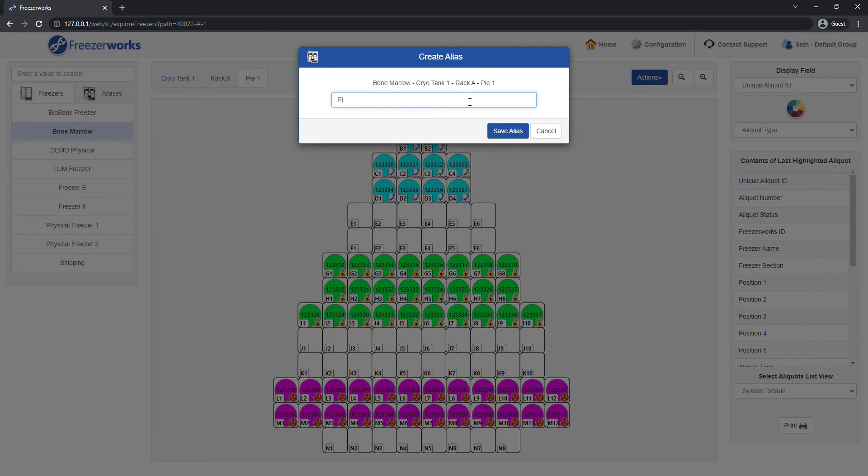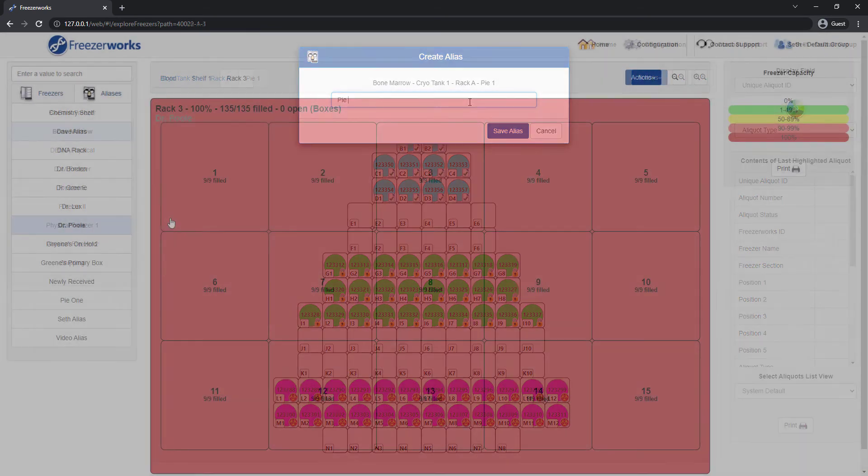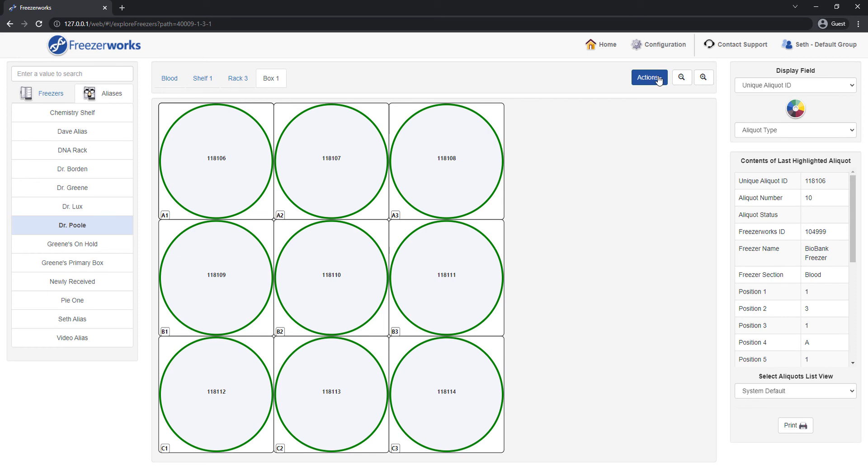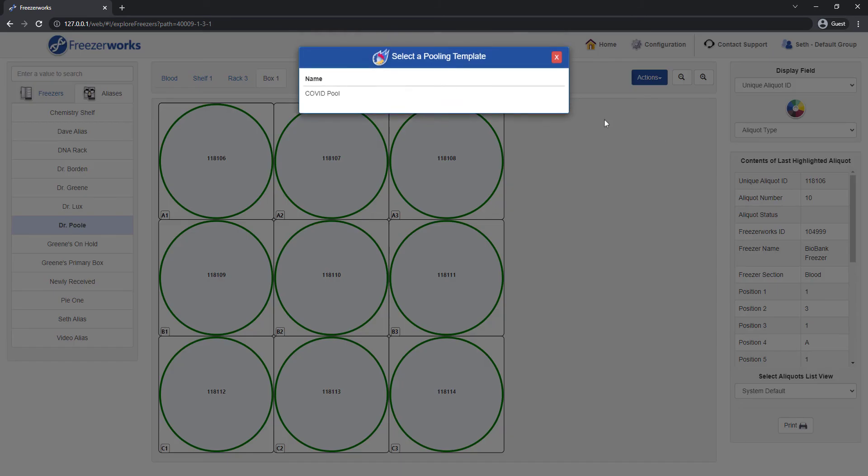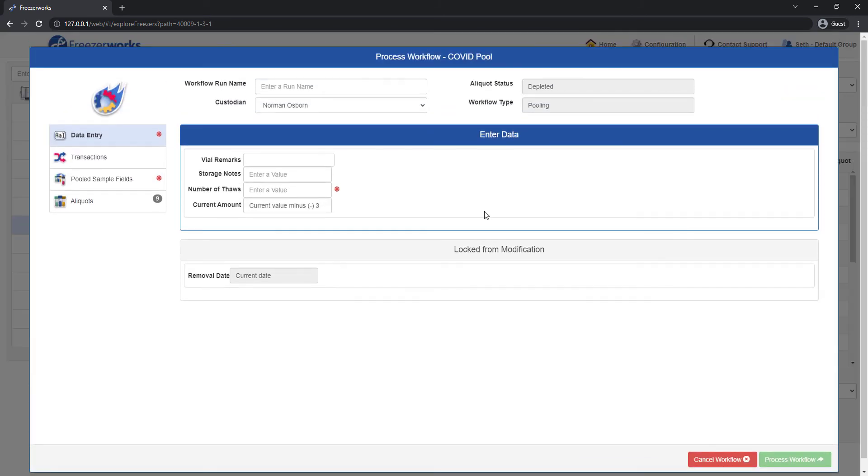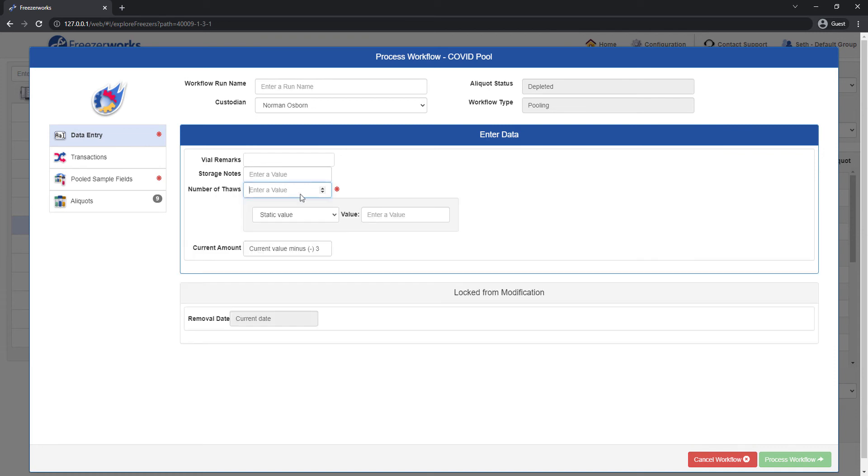And that about wraps up Freezerworks 2022. If you're looking for more on the new product, the What's New topic in our User's Guide has contextual links that will open detailed explanations of everything discussed today.